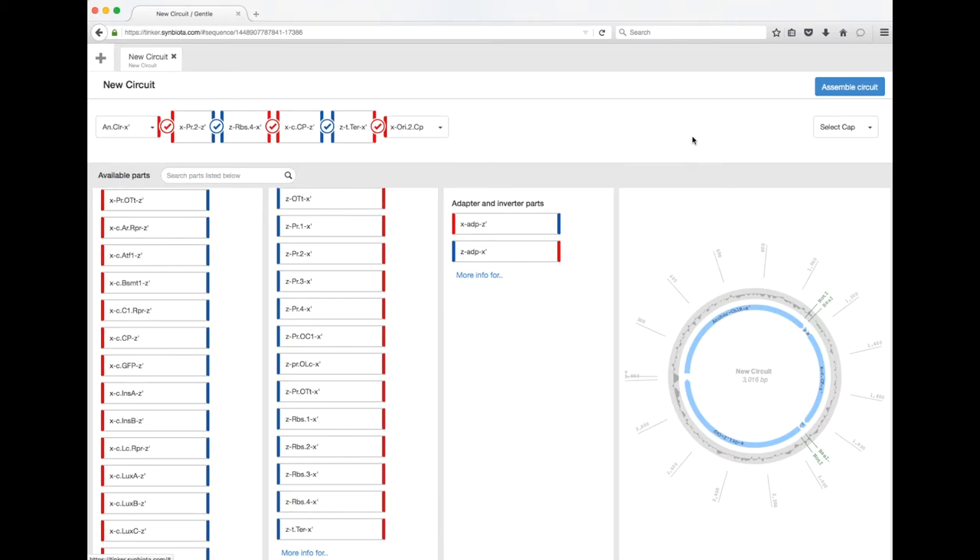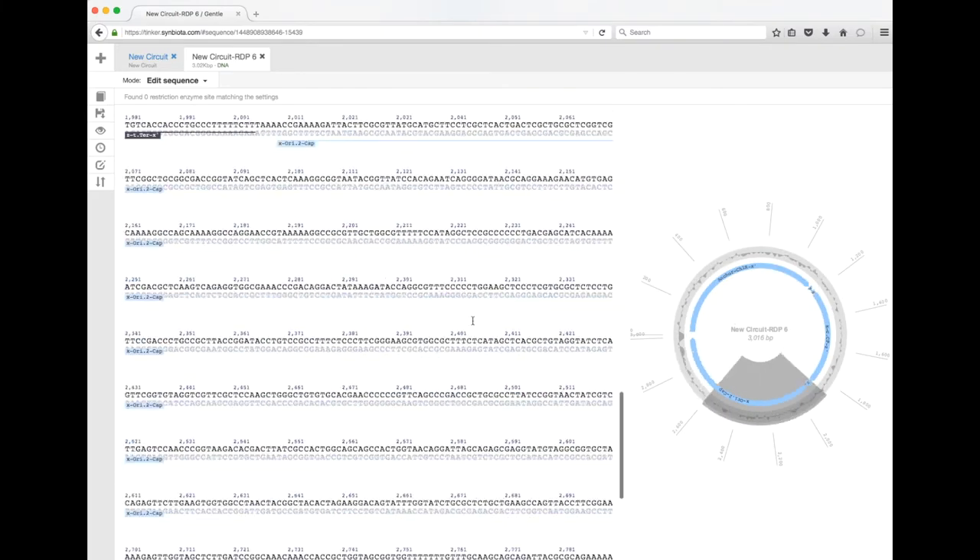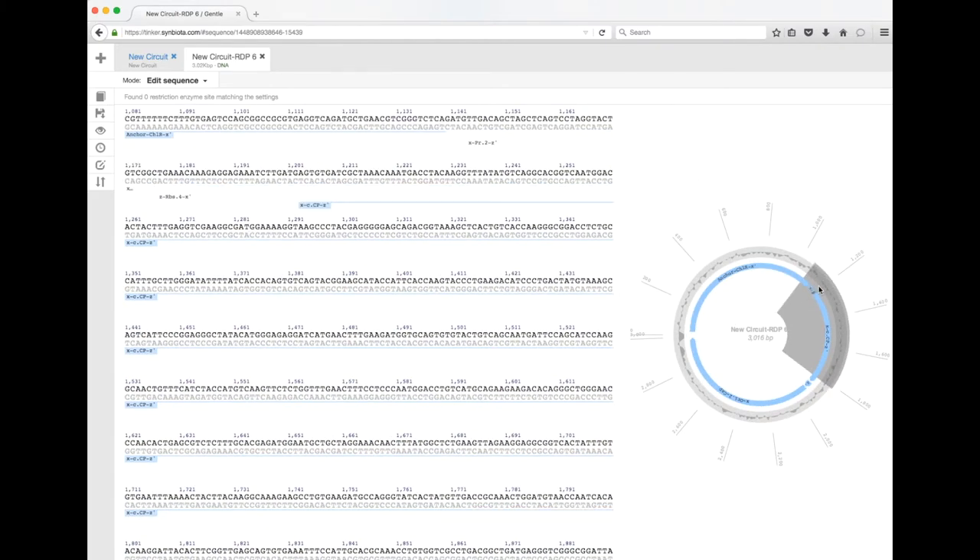Now I can click 'Assemble Circuit' and we're going to see the full circuit created. Clicking back, here's the anchor, then we've got our promoter right here, we've got our RBS, and then we've got our coding sequence for the blue chromoprotein.